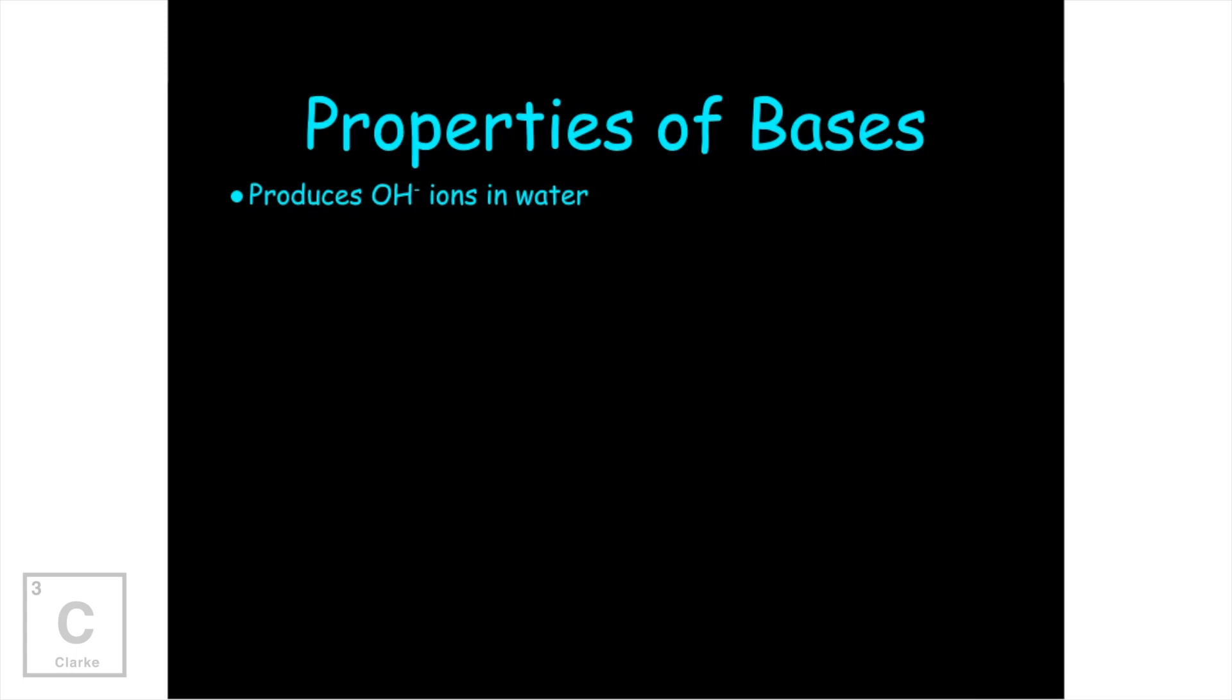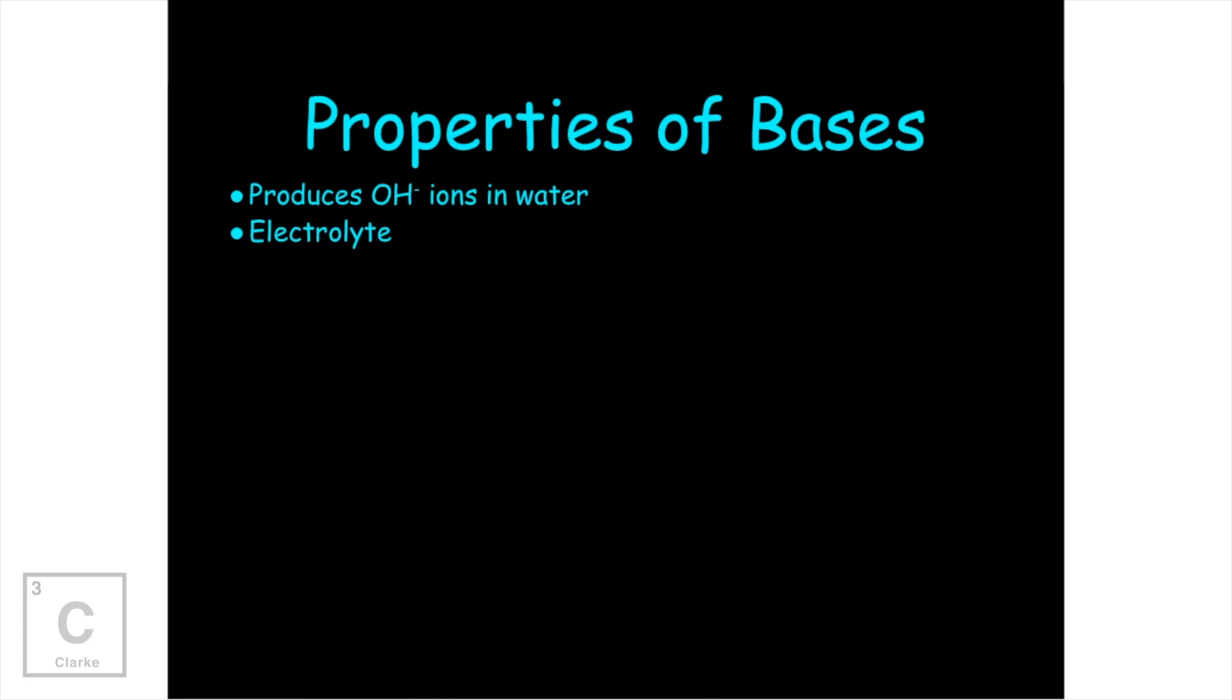Let's talk about properties of bases. Now, when bases dissolve in water, they produce hydroxide ions, OH. Again, an ion, so it has a charge. So bases also are an electrolyte. Let's test that out.